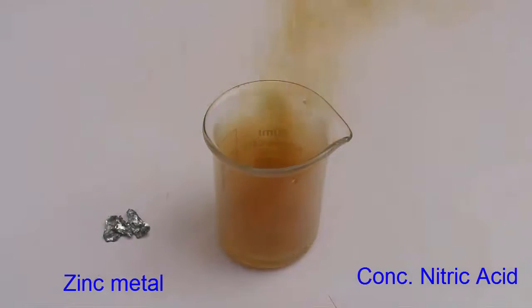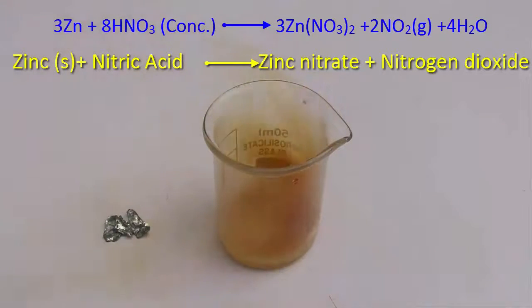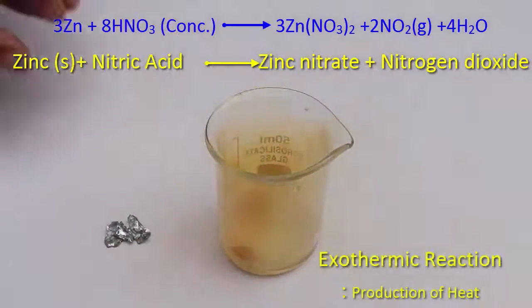A vigorous reaction will start immediately and brown fumes or gases will emit forth. The brown gas evolving from the beaker is nitrogen dioxide. The reaction is vigorous and exothermic which means that a lot of heat is produced.